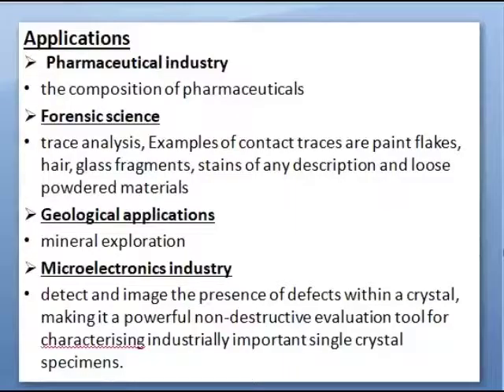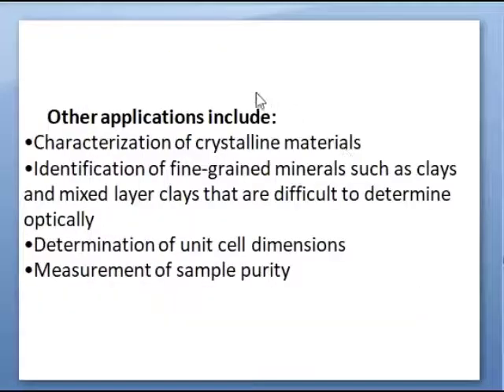So we have seen physically how this X-ray diffraction works. Now we'll discuss some of the applications. Basically, it is used in the pharmaceutical industry where the composition of particular materials is to be determined, forensic science, geological applications, and the microelectronics industry. Some other applications include characterization of crystalline materials, identification of fine-grained materials, determination of unit cell dimensions, and measurement of sample purity.